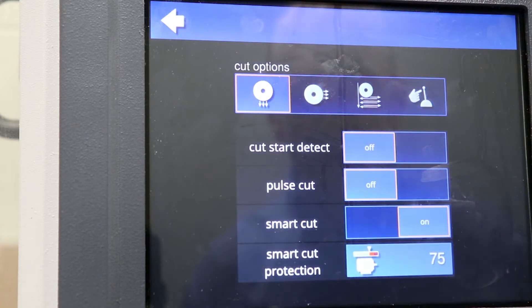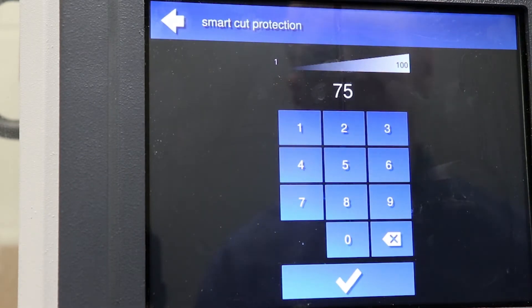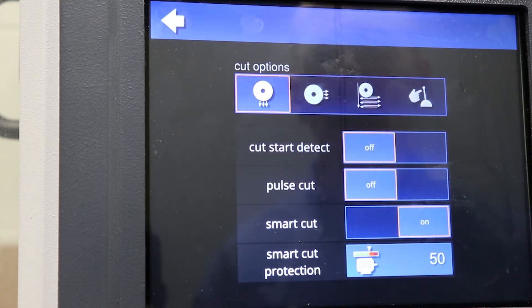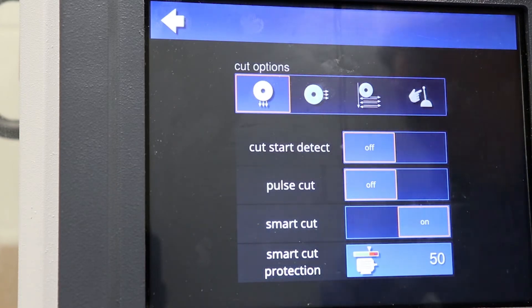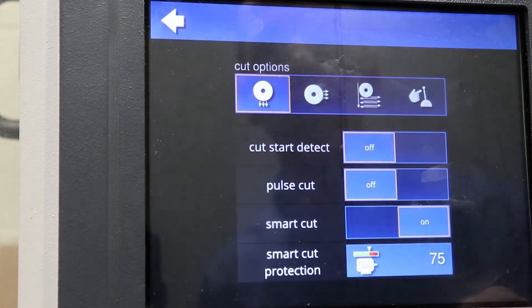Variable Smart Cut is a new feature for this saw. Smart Cut limits the power available for a given cut. You can set Variable Smart Cut to various levels of power depending on what you're cutting. Smart Cut really allows the user to automate the setting of feed rate, especially for samples with variable geometry where feed rate would vary considerably in areas of the part where cutting is more difficult. You can automatically have the machine slow down in those areas and automatically increase the feed rate in easier-to-cut areas depending on your application needs.